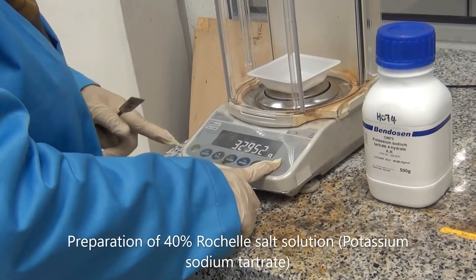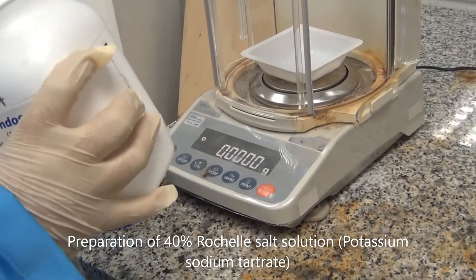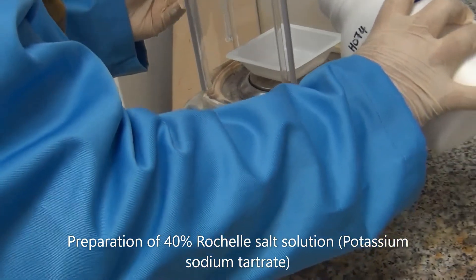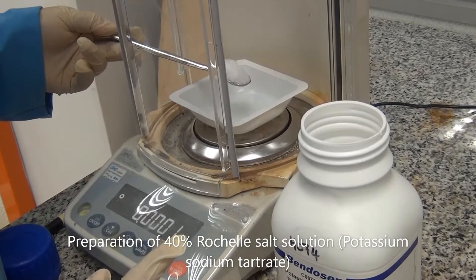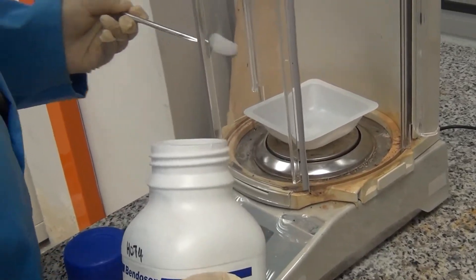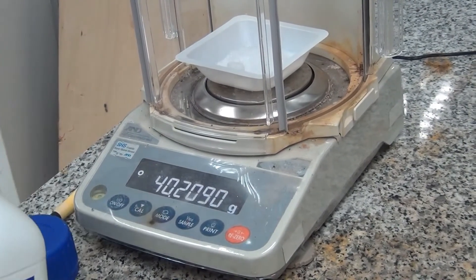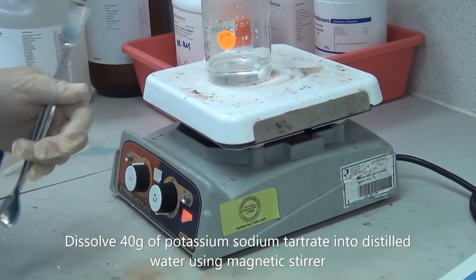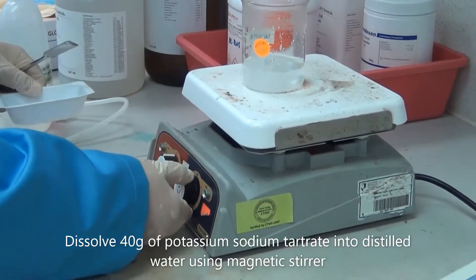Firstly, we have to re-zero the scale, and then we put 40g. So this is 40g.